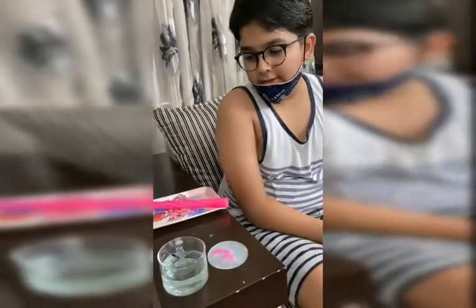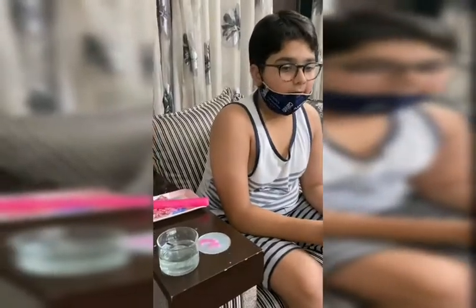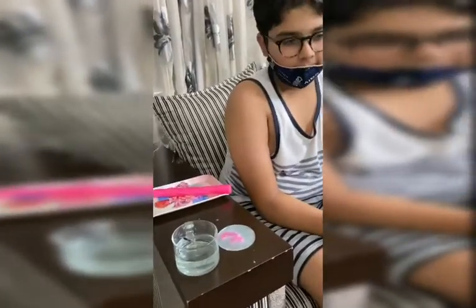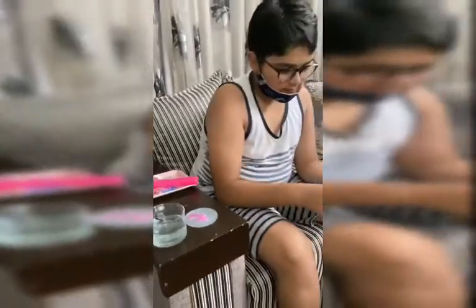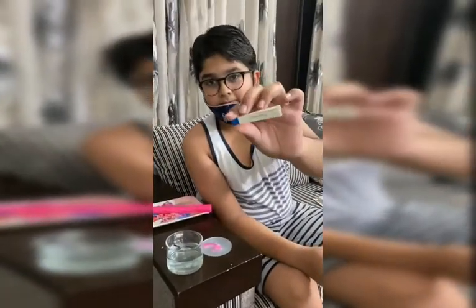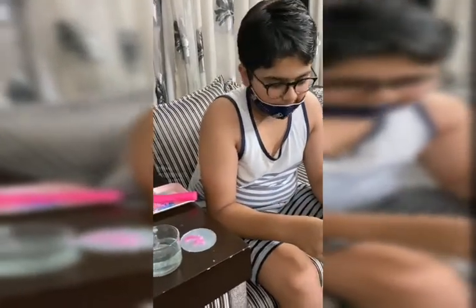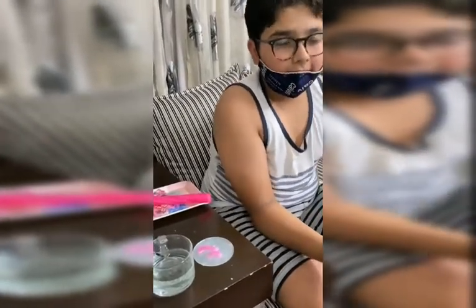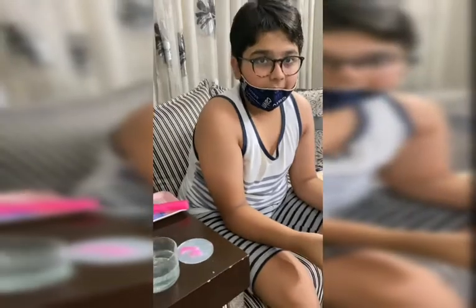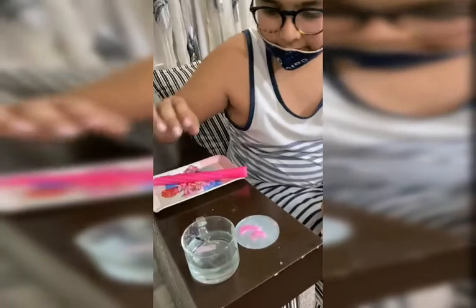Now I will put red litmus paper into the cup of water. So what is this showing? This is red litmus paper. Why are you putting the red litmus paper in? I want to check if this is basic in nature or acidic in nature. Okay, so now I'm going to put it in.